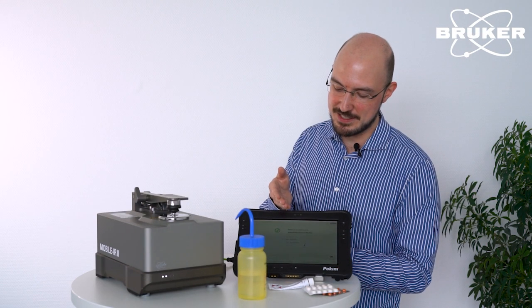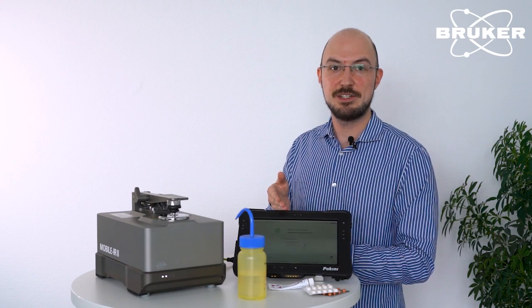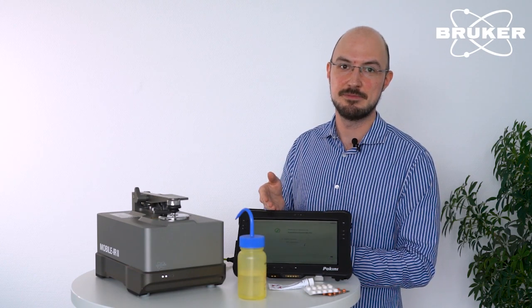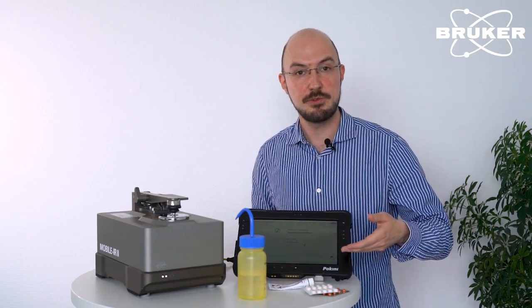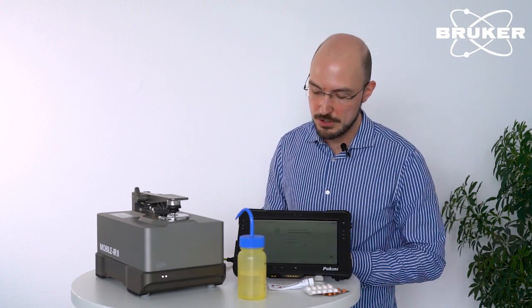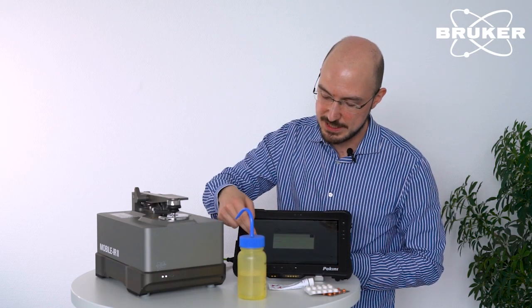Now, after the measurement is done, the aspirin was correctly verified with a green check mark. And again, simply as with the identification, you can continue with the next sample, or you have the possibility to sign the experiment now.